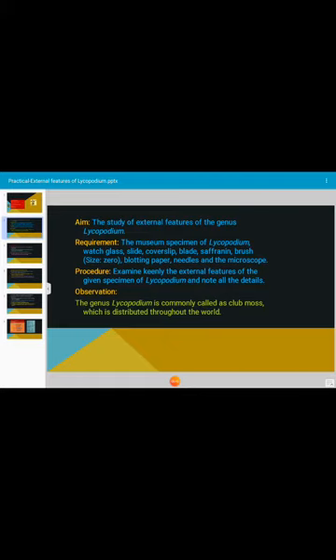We have to observe the external features of the given specimen Lycopodium with the help of magnifying lens and we have to note all the details.